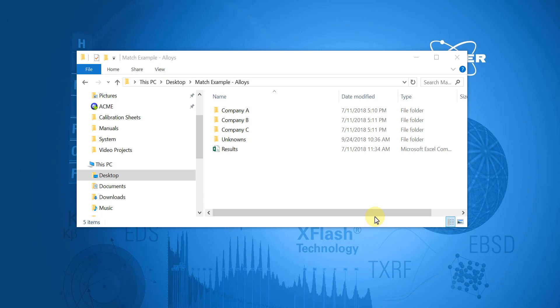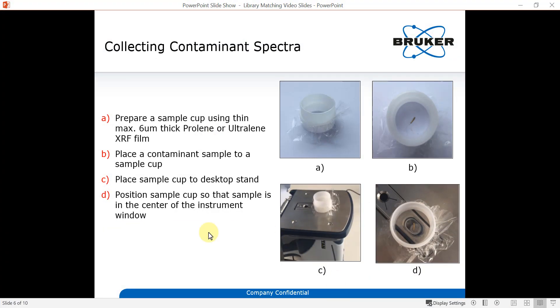Also have any coatings or paint removed as possible. On the other hand, if the sample is too small, it's recommended to place the sample between two layers of XRF film, such as Proline or Ultraline, and clamp it down using XRF sample cups. That way the sample can be placed on the desktop stand and centered on the instrument window.